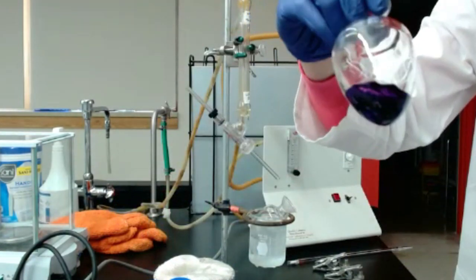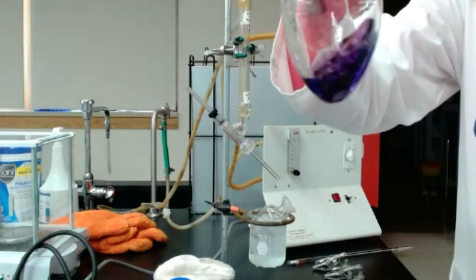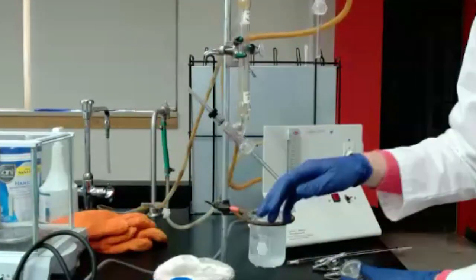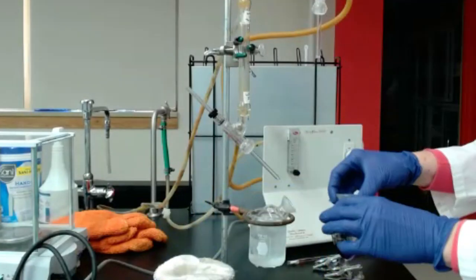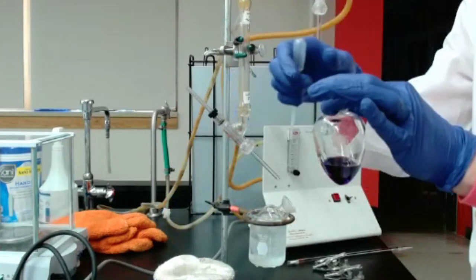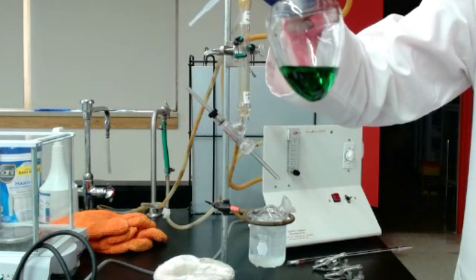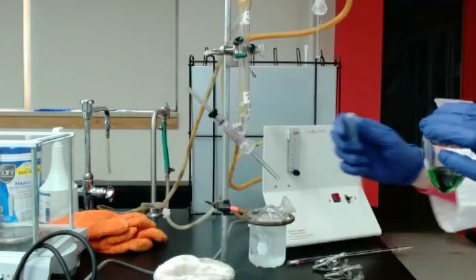So to make sure it's green, we will need to add some sodium hydroxide solution, because right now it's really purple. So I'm just going to add a few drops of sodium hydroxide, NaOH of 0.01 normal, until I reach the pale green color. I need to make sure I stir all the time, because if I don't stir, I won't see the color change. All right, so I've got the pale green, so I won't add more.